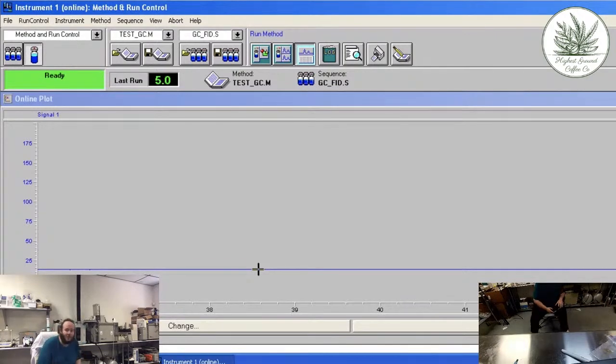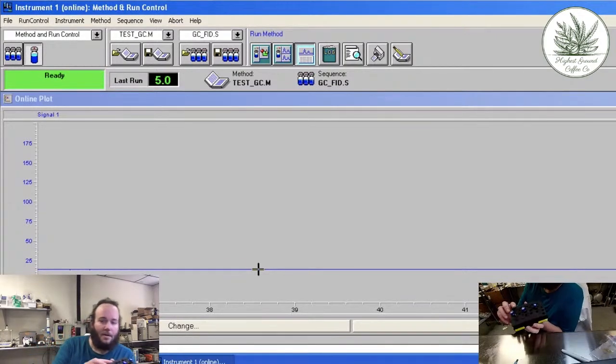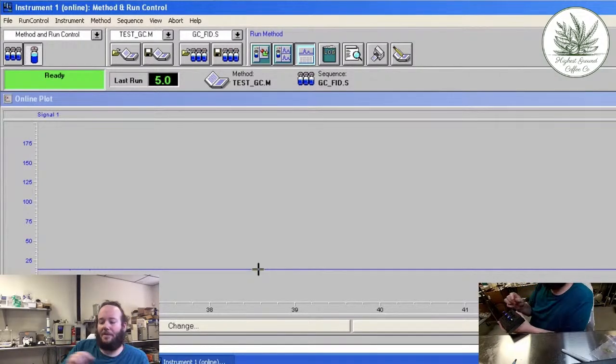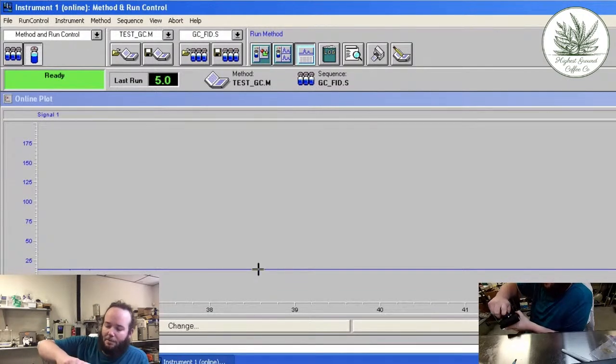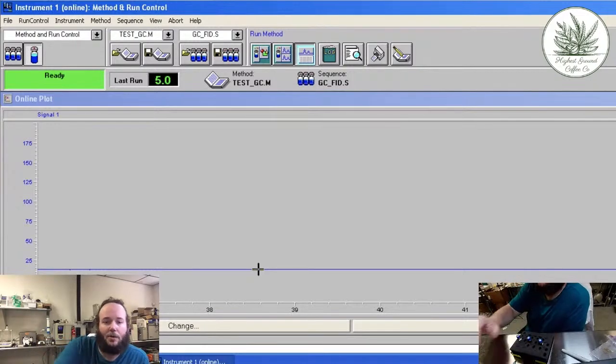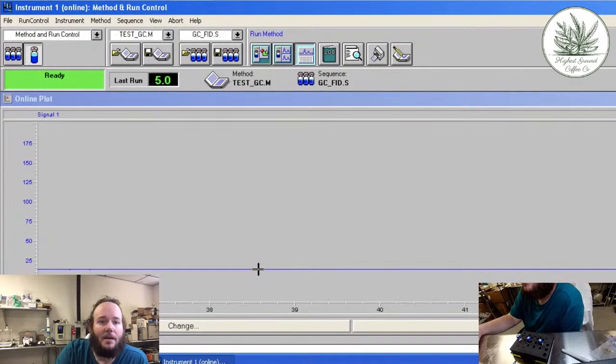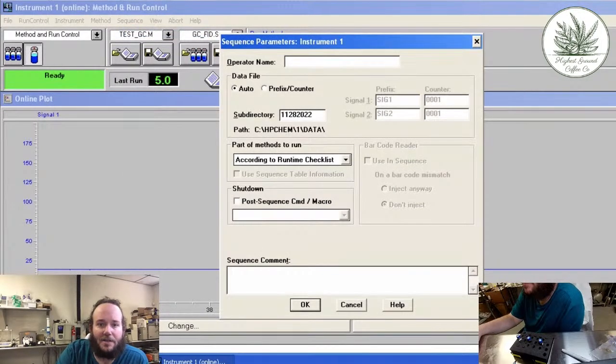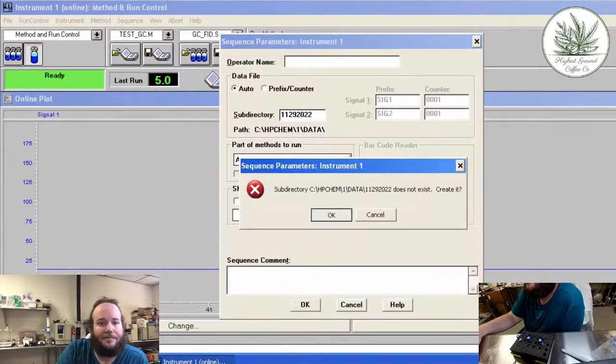All right, so these are done. And now we're going to go ahead and pop these into the slots on the GC. They're already programmed in there. And actually, you know what I'm going to do? I'm just going to change this, in fact.